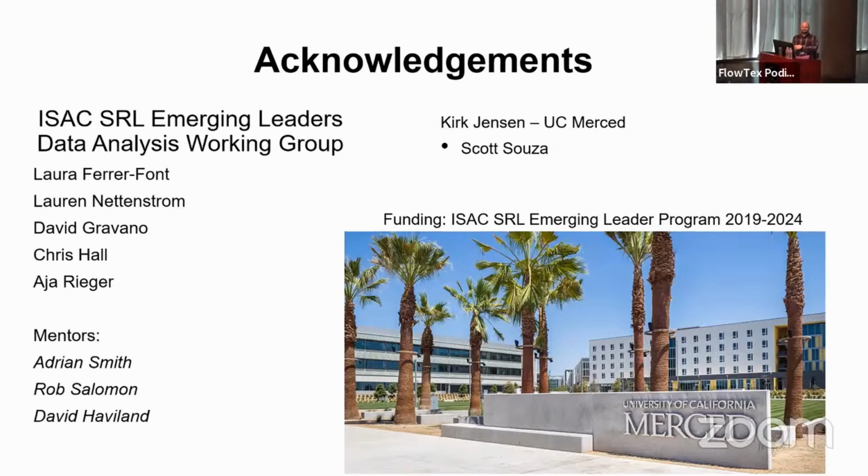And then me going, hey, have you ever heard of the table editor in FlowJo, or whatever analysis platform it happens to be? And then watching their reaction, oh my God, the days that I've wasted. I wonder if you could comment on that.